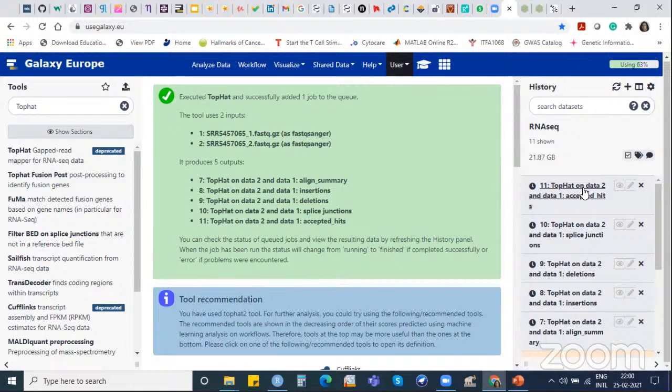But what I can do here, I can see what transcripts are available. Say suppose I have given some treatment to my zebrafish. So that is my sample. I have created some mutation in my zebrafish, and I would like to see whether any transcript changes are there with respect to reference, or any variation is there.